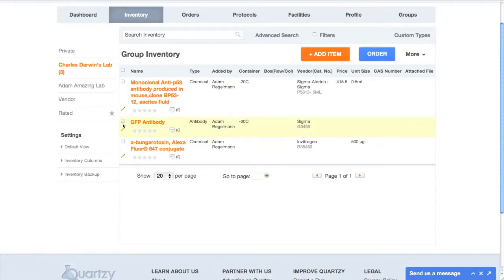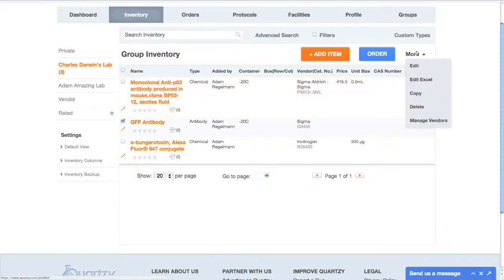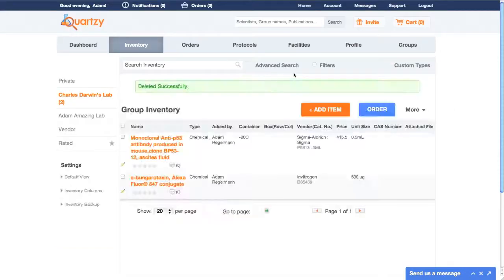Now let's get back to that inventory and delete some stuff. I just select a few items, hover over more, and click delete.